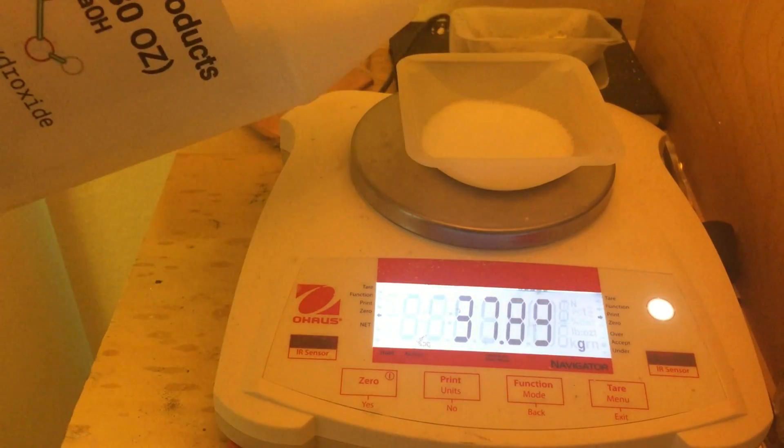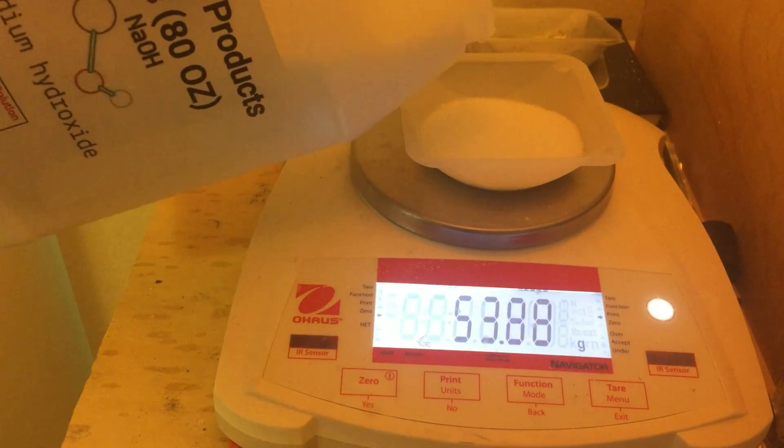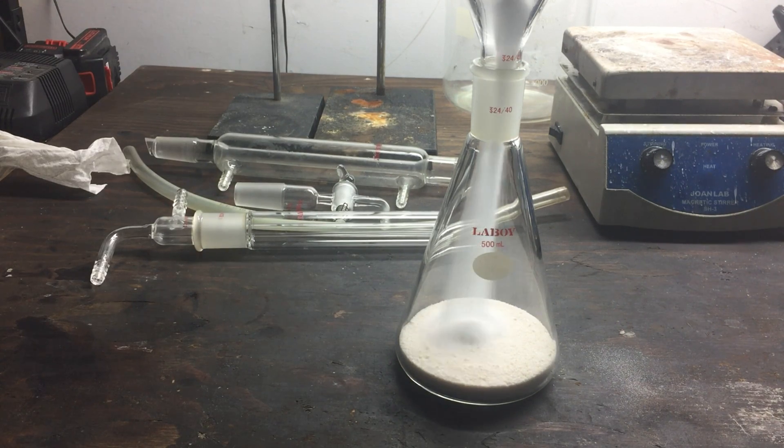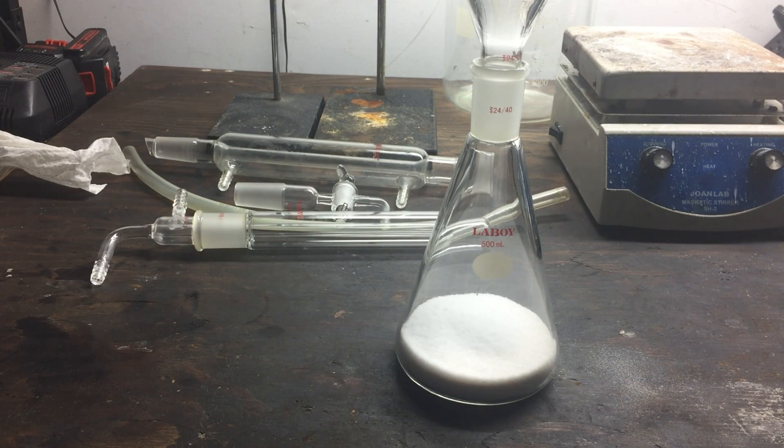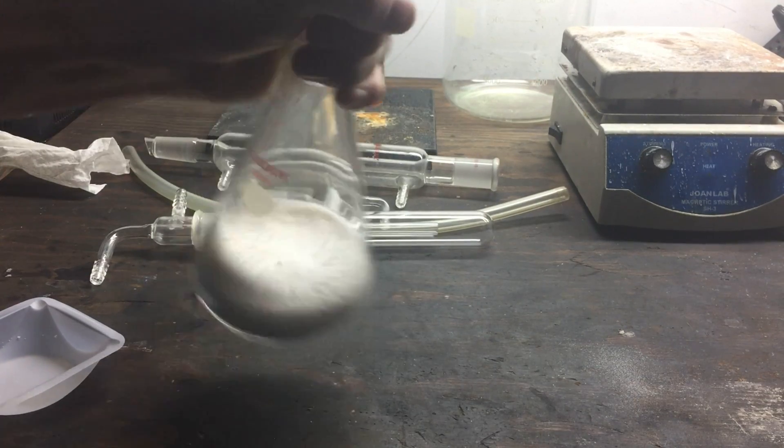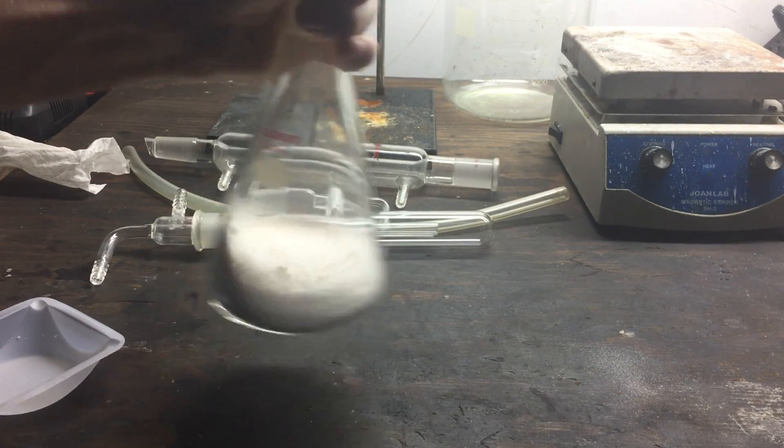Once the ammonium sulfate was added to the reaction flask, I needed to weigh out my sodium hydroxide. The sodium hydroxide was then added to the reaction flask as well, and the reactants were swirled in the flask to achieve a more homogenous mixture which will allow them to react quicker.